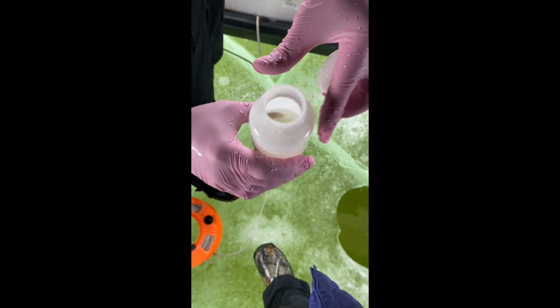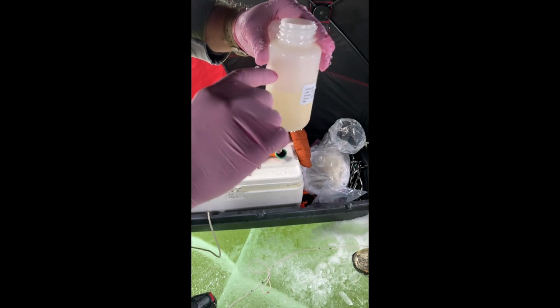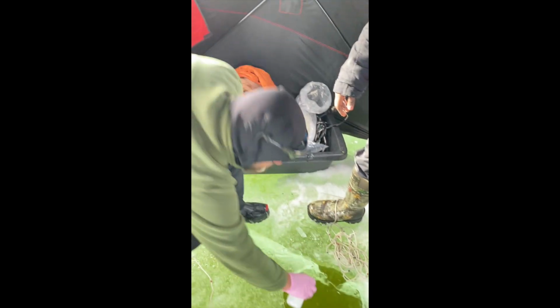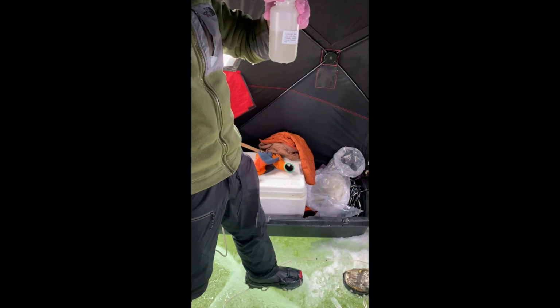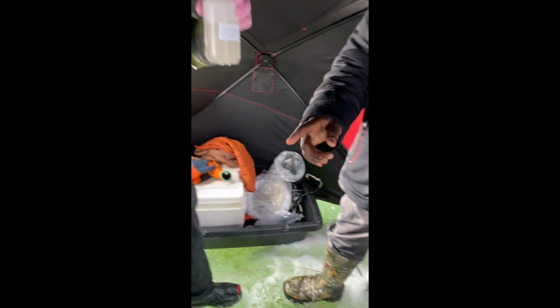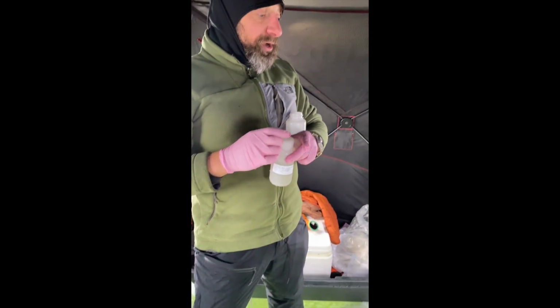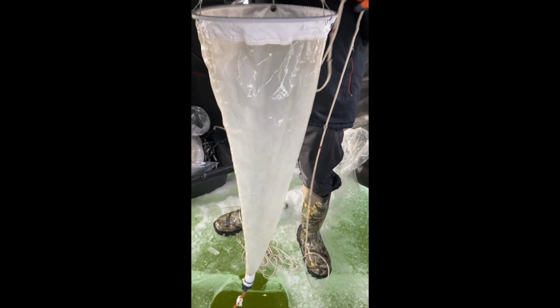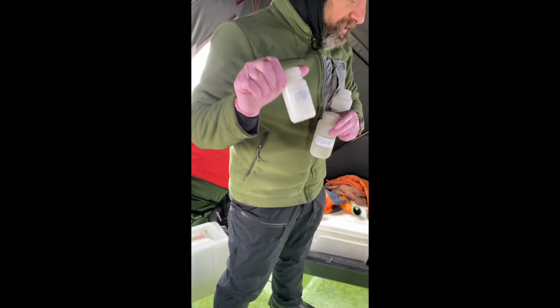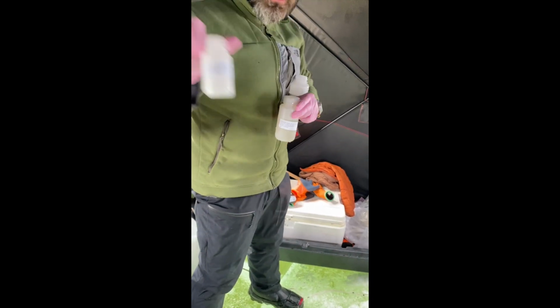Yeah, and what we'll do is top the bottle up to about 80% with, say, surface water using the other bottle, and then when we get a chance sometime in the next hour or so, we're going to preserve the sample with Lugol's. How much? Oh, 10 mils of Lugol for this jar, and then 5 mils of Lugol's for the smaller jar for the 35 micron mesh. So we're going to do another replicate with the 80 micron mesh now, and then we're going to switch nets to the finer net and again do a single tow with each one of the 35 micron tows into the smaller bottles.